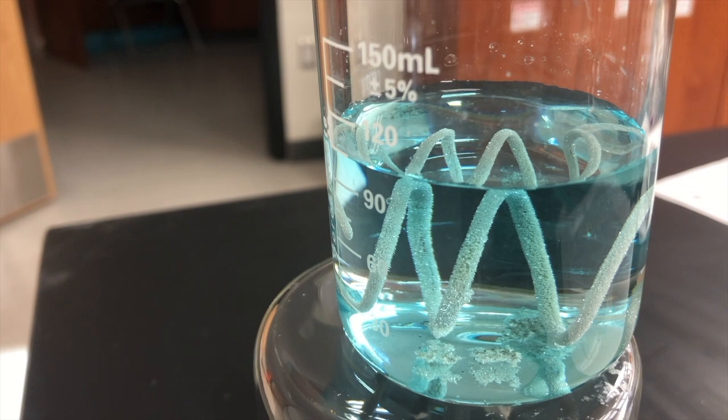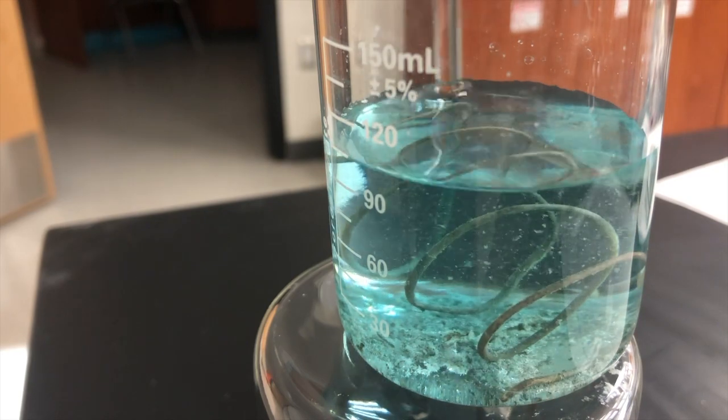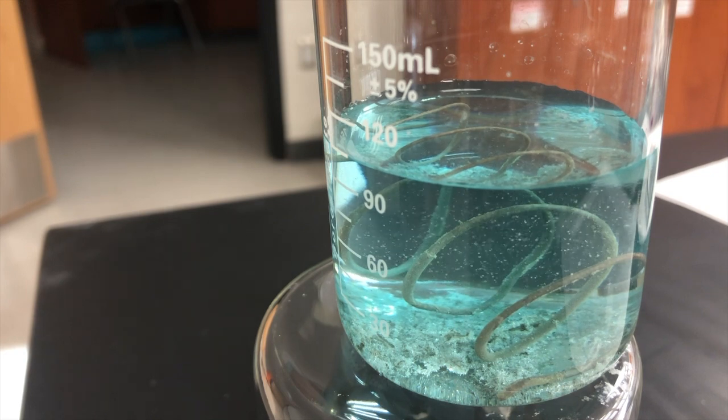So what I'm going to do now is stir it a little bit and knock off the silver, so that our copper is available to keep reacting. All right, let's keep watching.